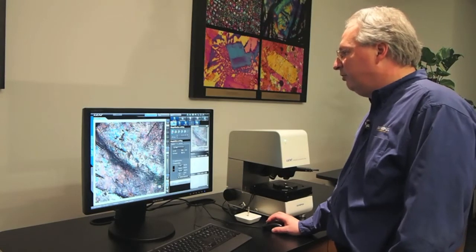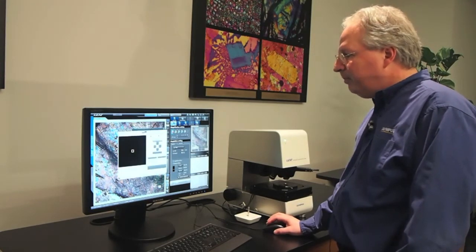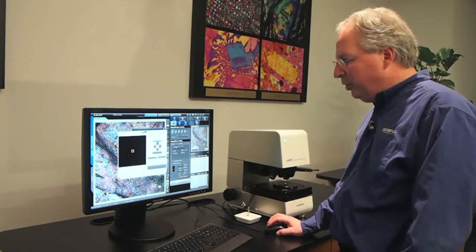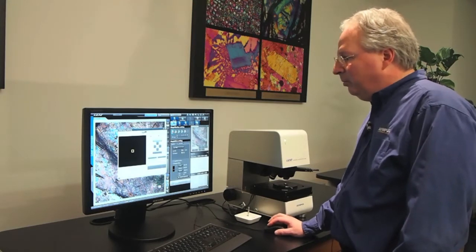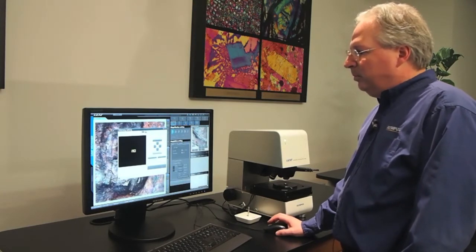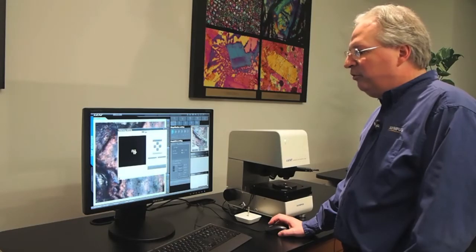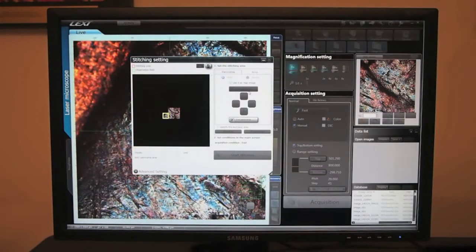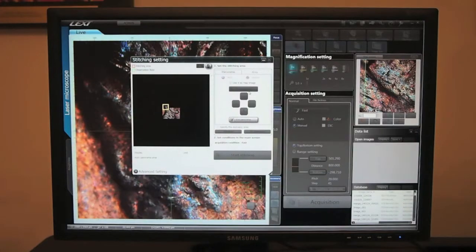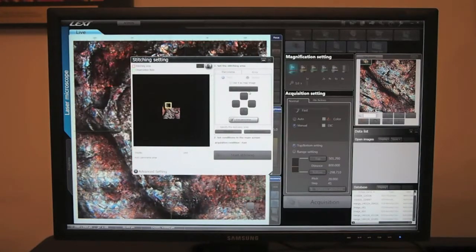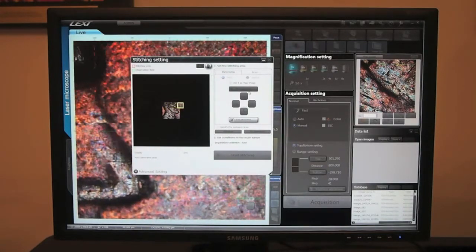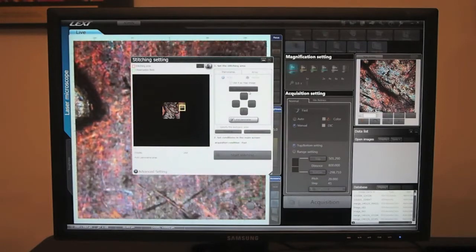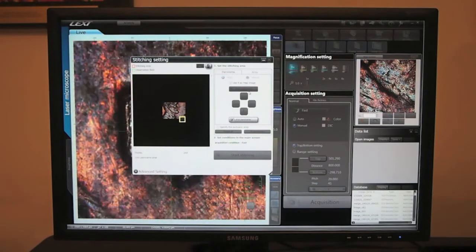Let's start our stitching application and take a quick panoramic view of that sample. We can see the stage moving, very quickly scanning around the sample. Pretty quickly you can probably guess what this sample is. Let's watch as it finishes scanning.